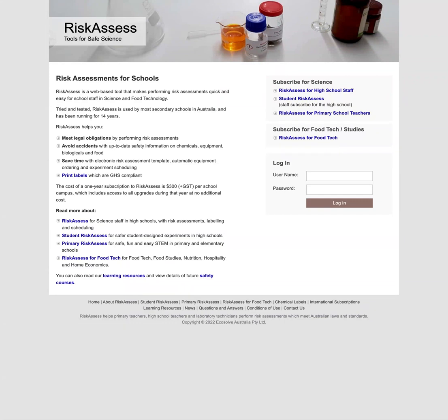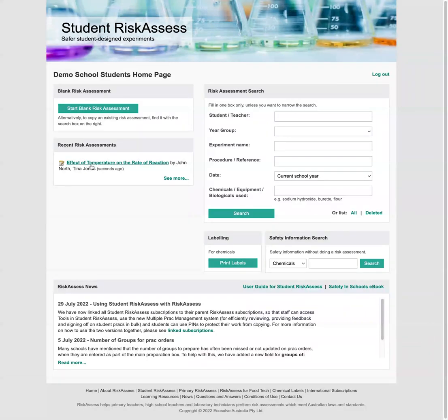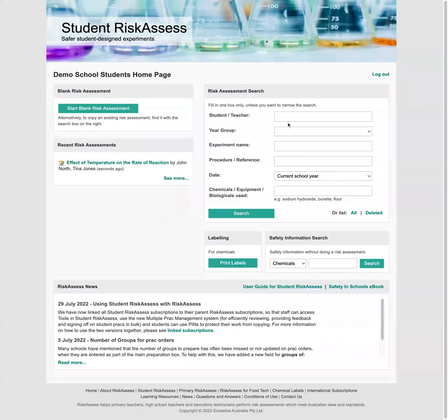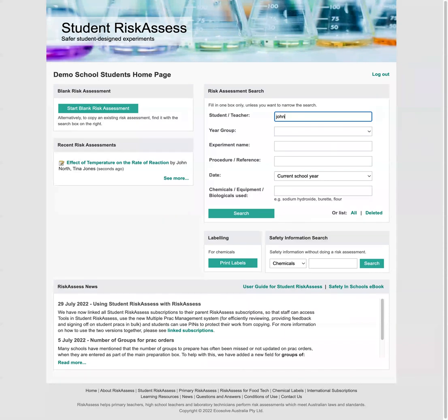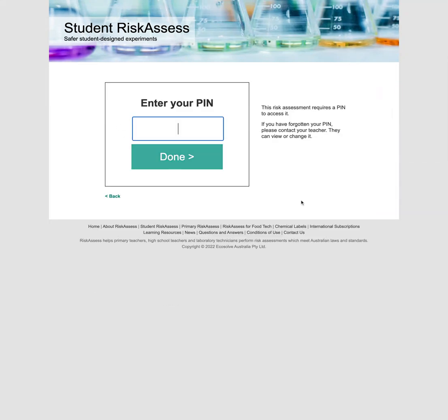So say it's the next day and we want to continue our risk assessment. We'll log in again with the username and the password that teacher is giving us. So actually we can see our prac here in the recent risk assessments, which is pretty handy. But this won't always be the case if there's lots of pracs being done by other students. So we'll do a search to find our prac again. So we can put in any of the student names. So we'll do John North. And we can see our prac here. So we click on it and we need to enter our pin number to access it.